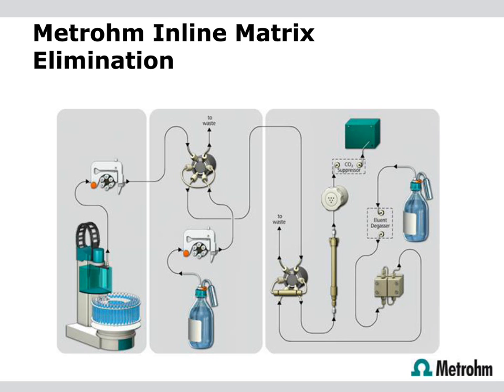And if we're looking at removing organic matrices, of course we would use an ionic trap column, so the ions are trapped on the column and all the organic matrix is flushed directly to waste. This transport solution can be water, it can be IPA water. So again, if you're looking at very hydrophobic drugs or molecules that you would normally have to perform some kind of extraction on, instead of performing an extraction, you can just eliminate the organic material by pre-concentrating and flushing the excess organic to waste.